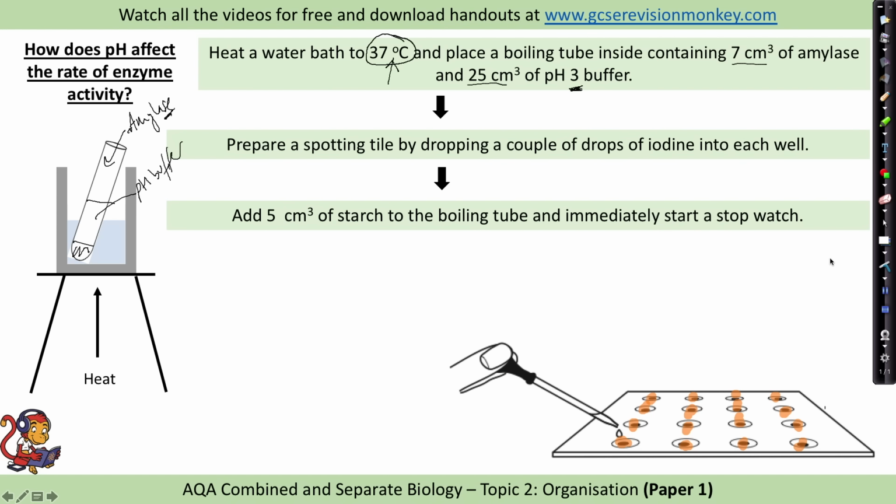Our next step is to add 5 centimeters cubed of starch to the boiling tube and immediately start the stopwatch. So amylase, if you remember, breaks down starch, so we will add our starch into the boiling tube and immediately start our timer. Now every 30 seconds we are going to do continuous sampling. This is a method which shows continuous sampling.